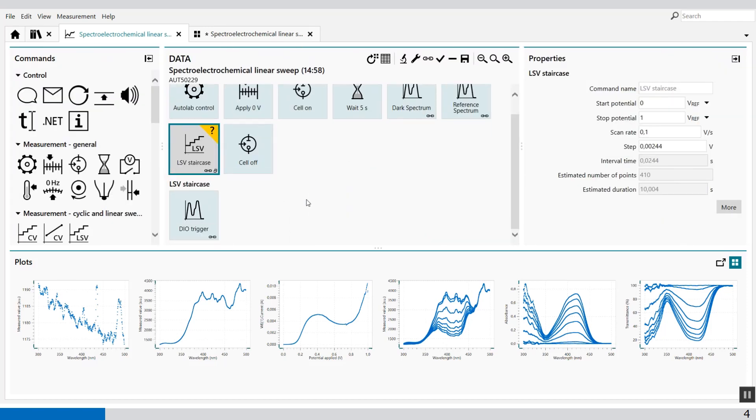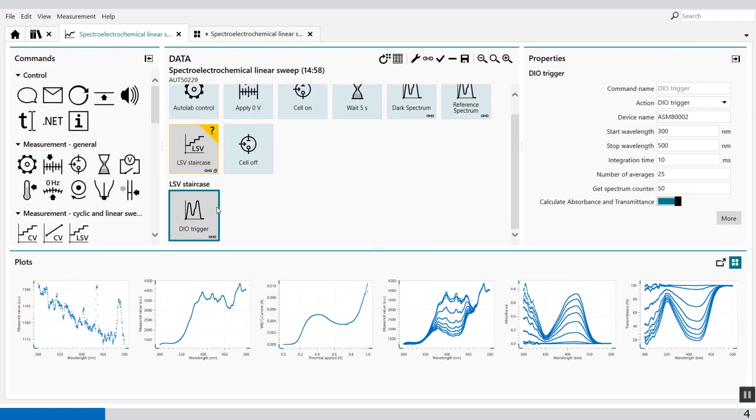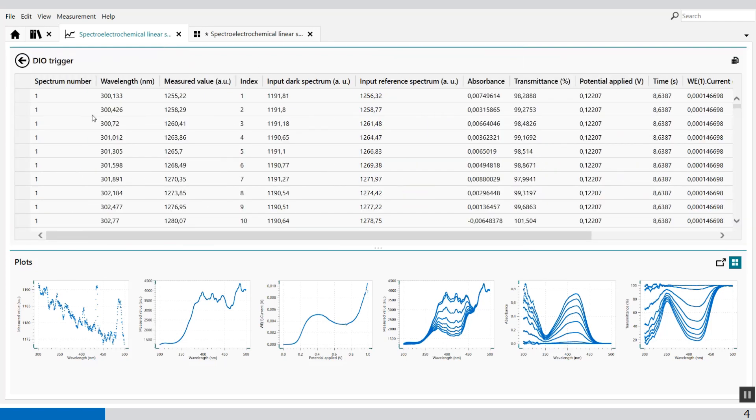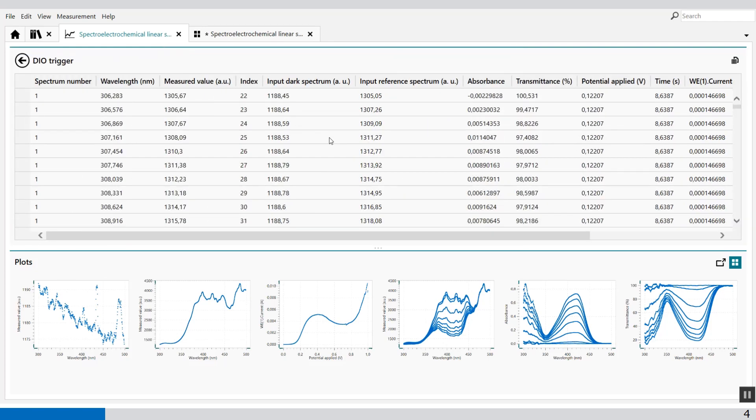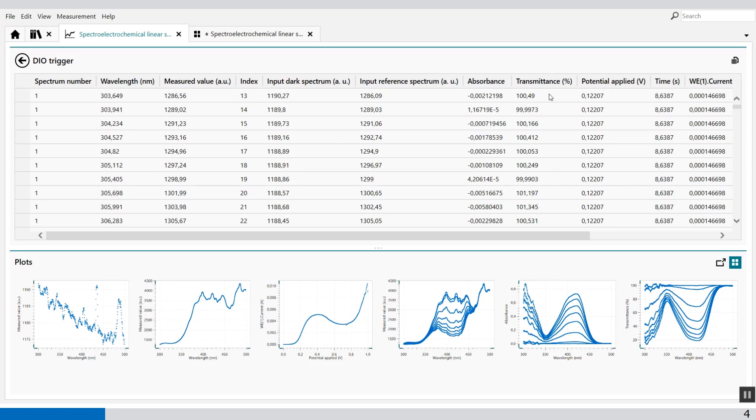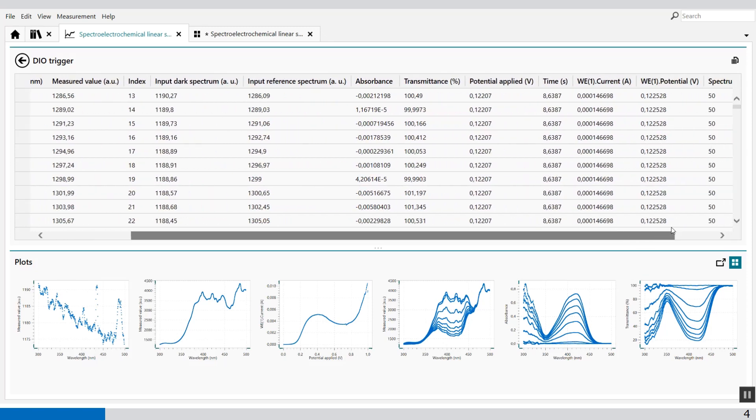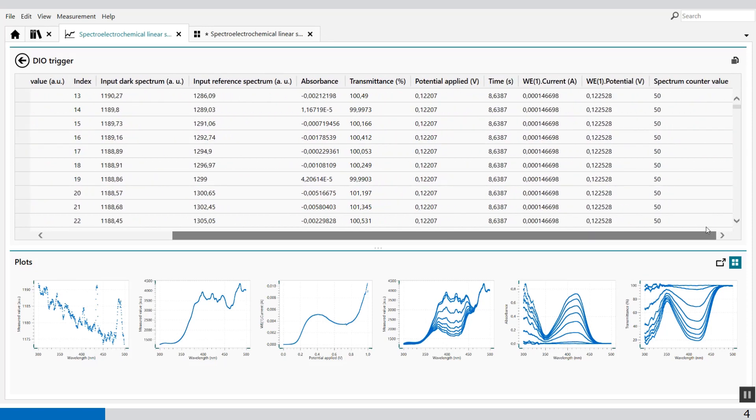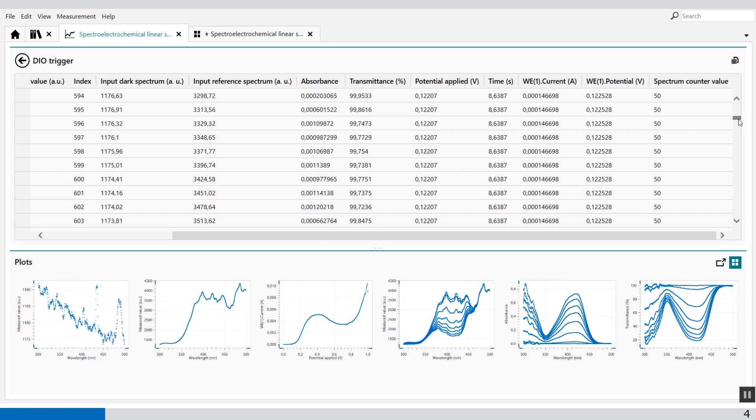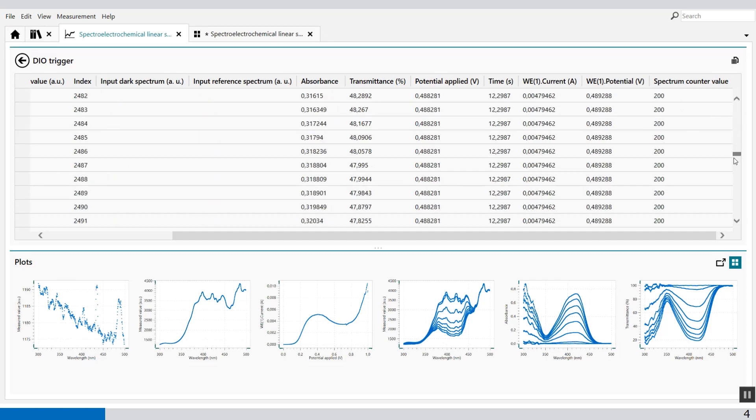You can also visualize the raw data by the DO trigger. And here you will see the wavelength measured, the input dark, input reference, and all the other information which is taken during the experiment. So you see how many spectrum you have available.